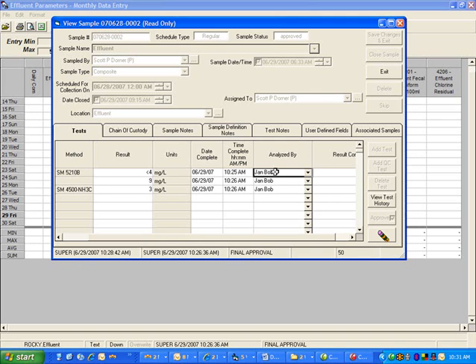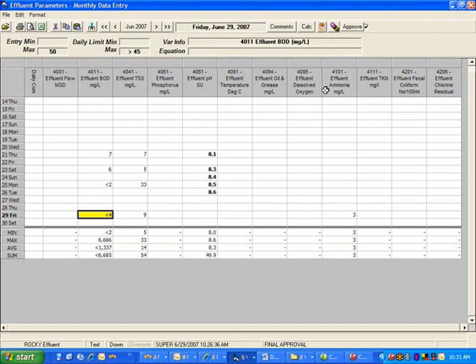So it allows us, again, the same thing over and over in Ops, that information is at our fingertips. The data that is in LabCal is now available for any reports, analysis, and graphs, just like anything else that comes from SCADA, operator entered data. It's all the same. And to Ops, it doesn't care where the data came from.